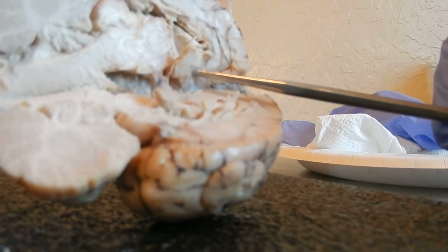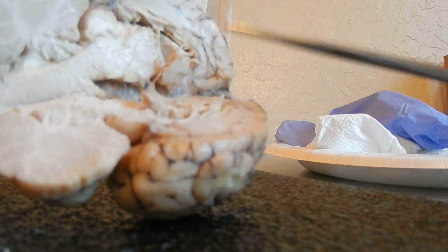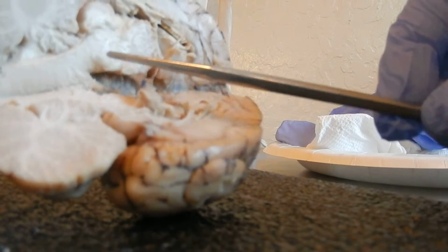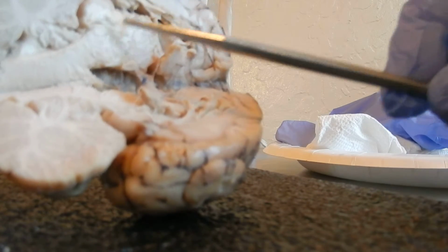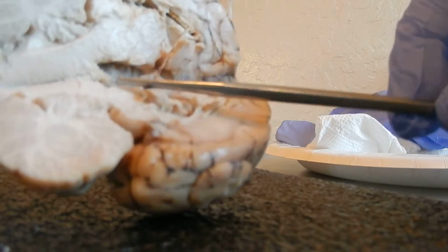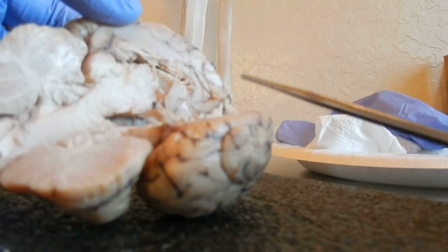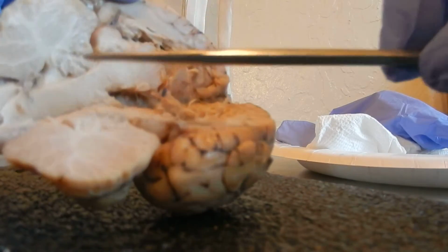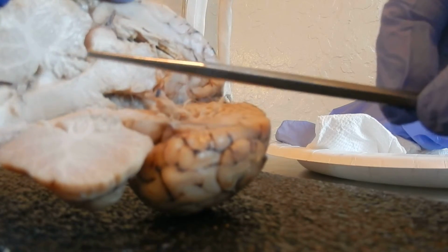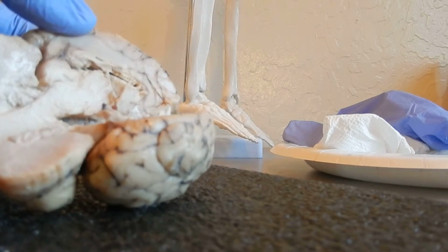Here you have the septum pellucidum, hypothalamus, thalamus, and of course, as we saw before, the pituitary. And when we were looking inside earlier, we saw the pons. So I'll give you a better look here of the pons.